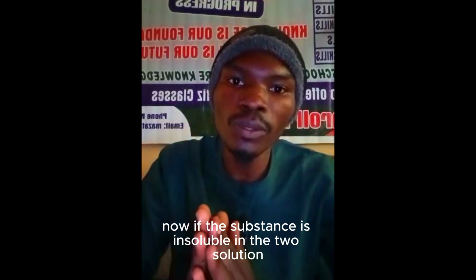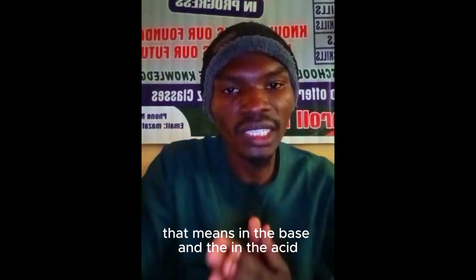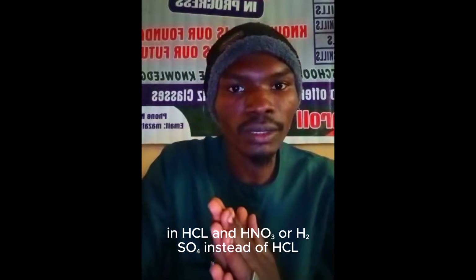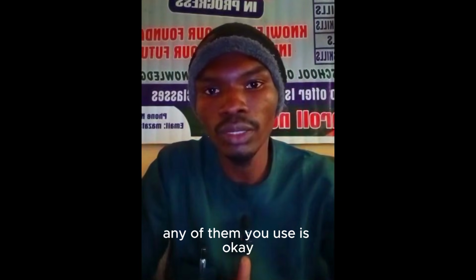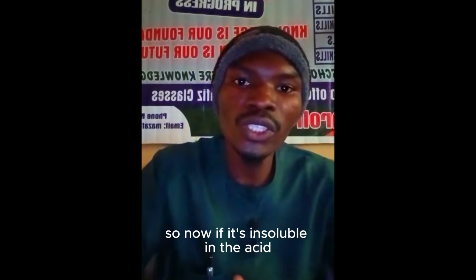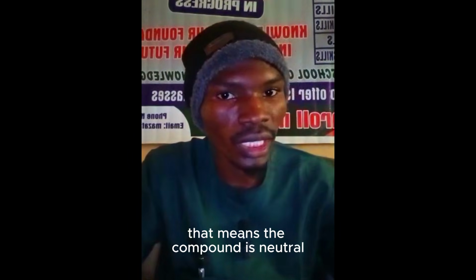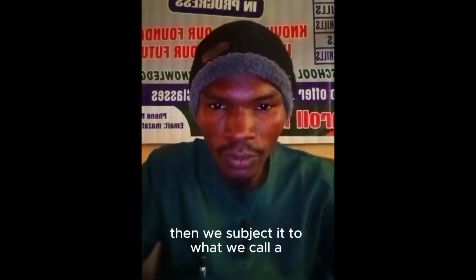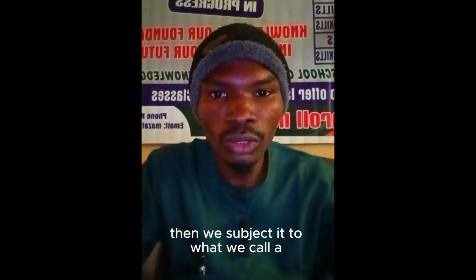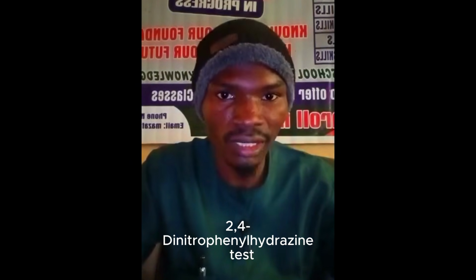Now, if the substance is insoluble in the two solutions, that means in the base and in the acid, HCl, HNO3 or H2SO4, any of them you use is okay, then the compound is neutral. If the compound is neutral, then we subject it to the 2,4-dinitrophenylhydrazine test.